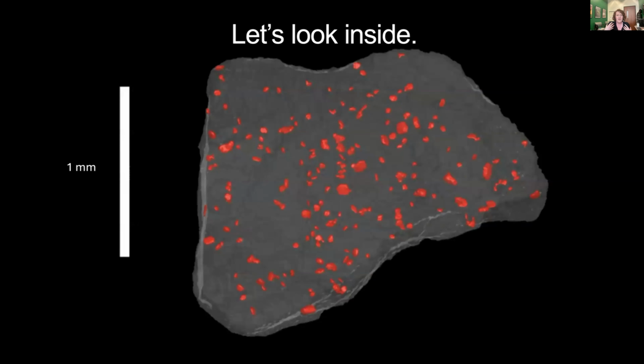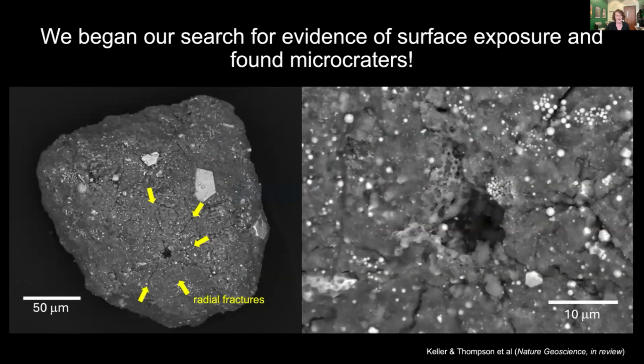So once we looked at the sample in 3D, we wanted to get it into the electron microscope and search for evidence of exposure on the surface of asteroid Bennu.